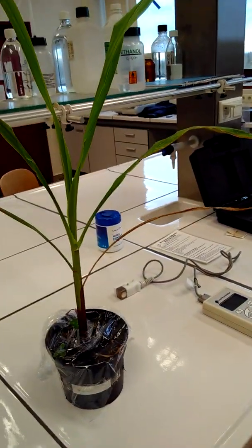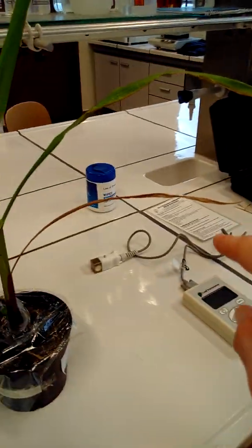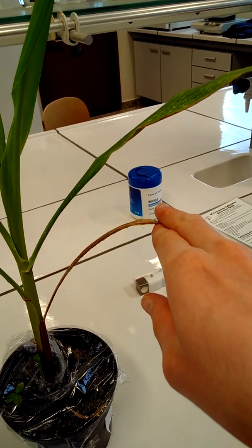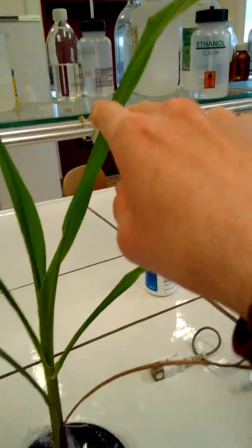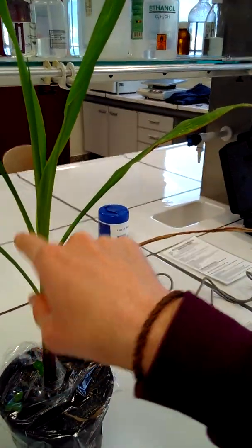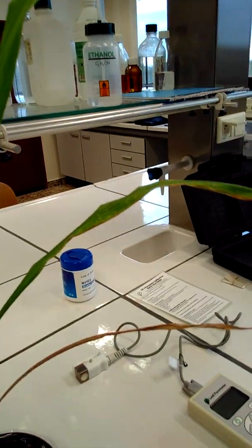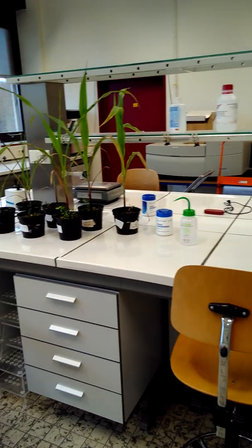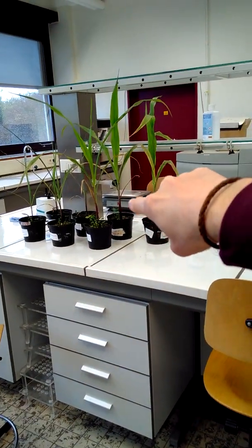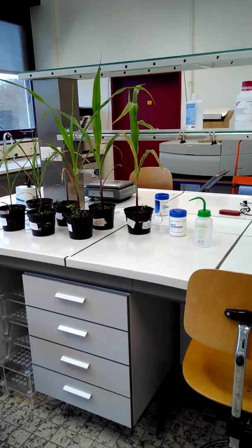One thing you need is the leaf area, which will usually be done by other people, and you need to link the porometer measurements to a specific leaf. So you know that values from this leaf, for example leaf E, I think, the fifth leaf starting from below, have certain porometer values. These should be linked to the leaf area, which I explain in another movie, and only then can you compare the measurements for the whole plant to the scale measurements.